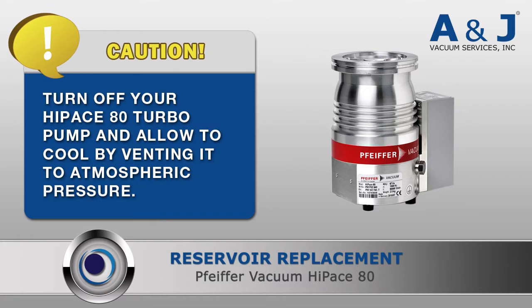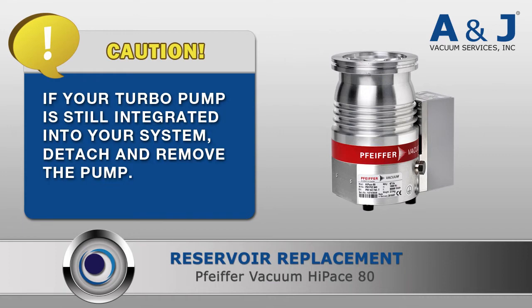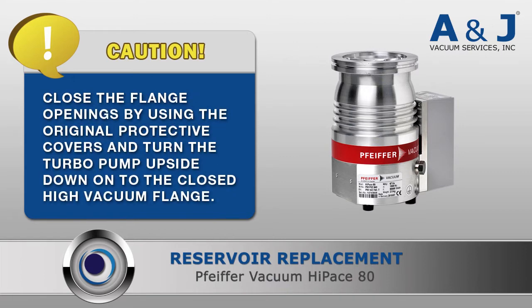Before starting your reservoir replacement, please take the following precautions. Turn off your HiPace 80 turbopump and allow it to cool by venting it to atmospheric pressure. If your turbopump is still integrated into your system, detach and remove the pump. Close the flange openings by using the original protective covers and turn the turbopump upside down onto the closed high vacuum flange.